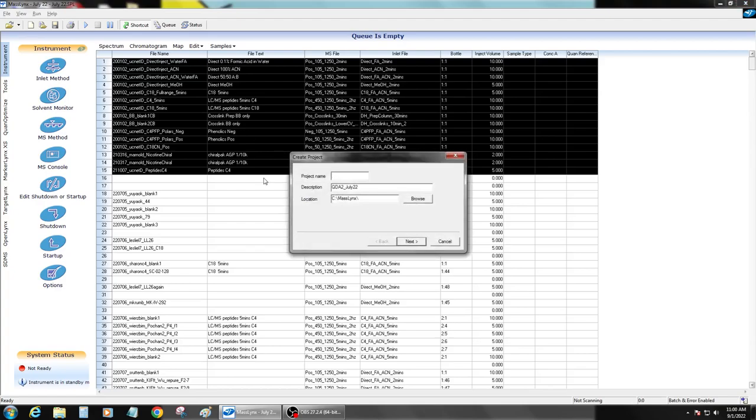Just going to create a Q-September 22 project. September 22.